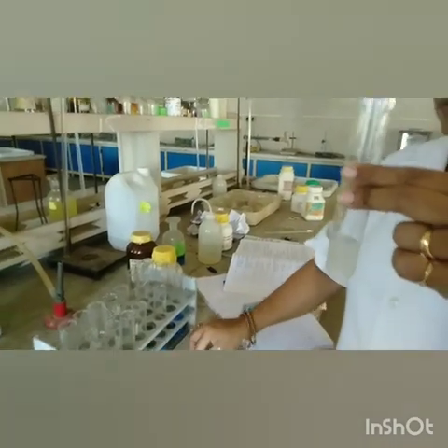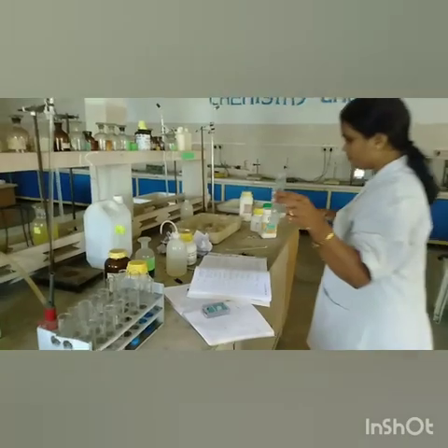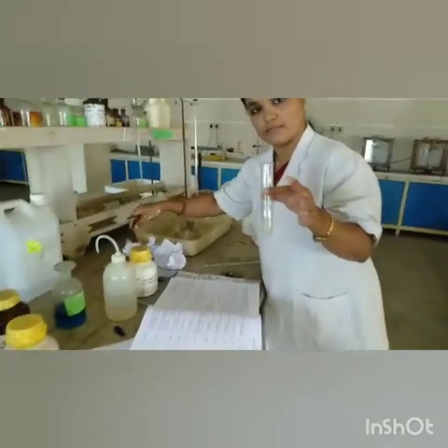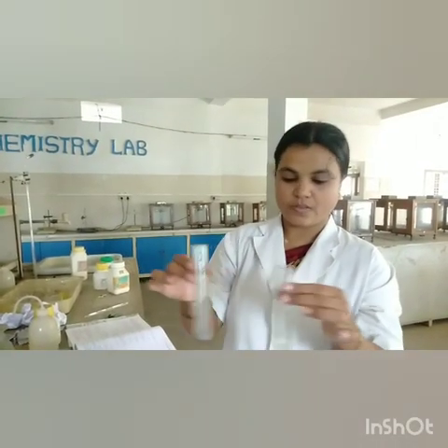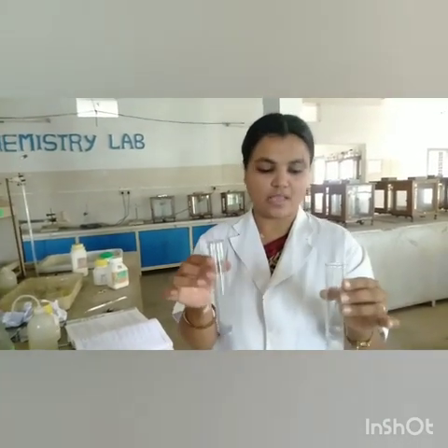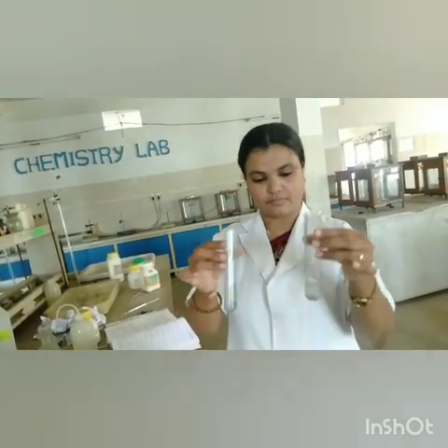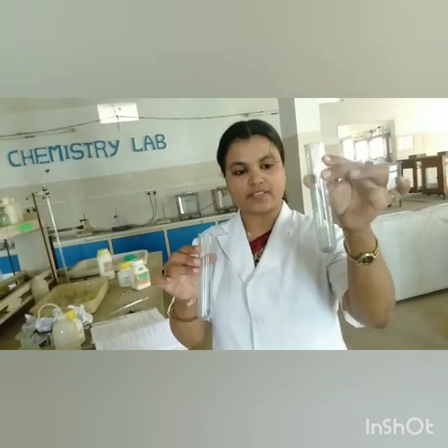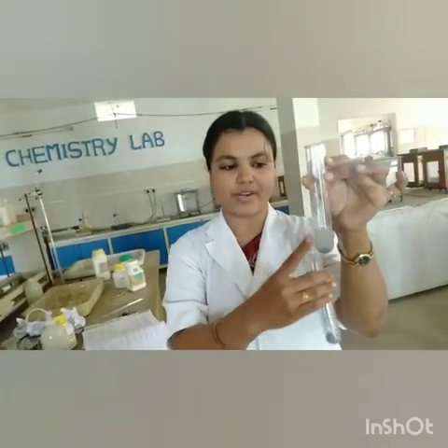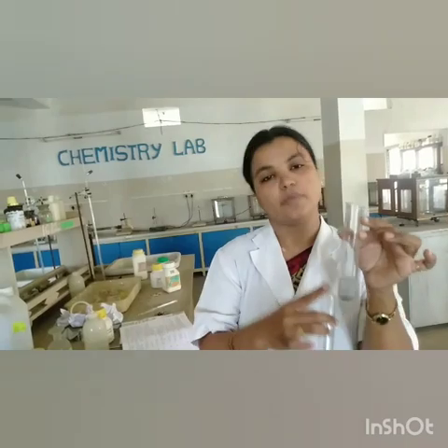Now to this I'm going to add some aluminium powder. When I add aluminium powder to the aluminium sulfate, nothing will happen because it's the same. No displacement will happen, and you can see that. I've just added it, and there is no color change, no reaction took place. So this is the first reaction where aluminium powder is made to react with aluminium sulfate.